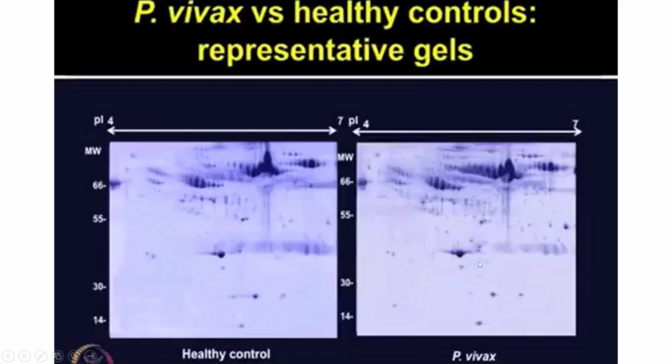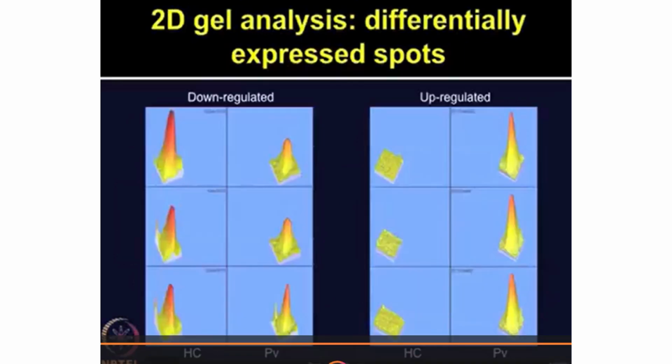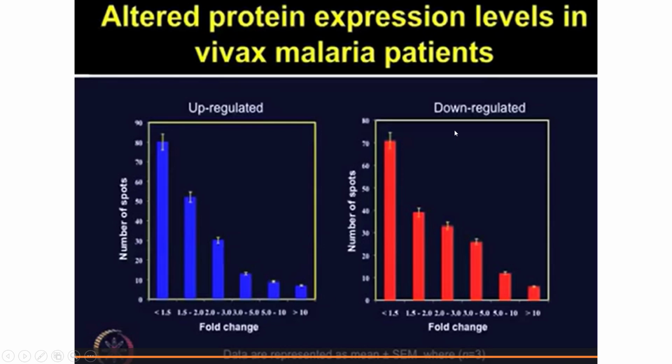So in the disease sample it is getting upregulated, and here it is at a normal level. Visually we might not be able to say this that accurately, but the software helps us do that, and it will help you find which proteins are getting upregulated and which are getting downregulated.